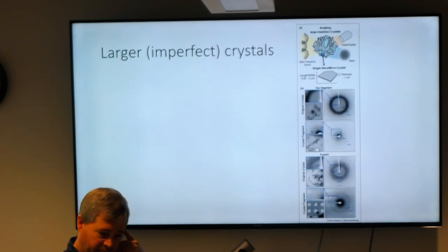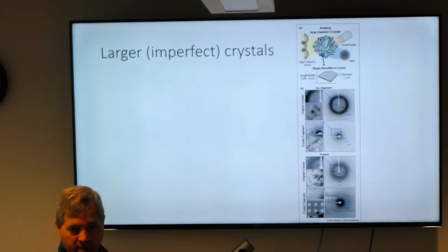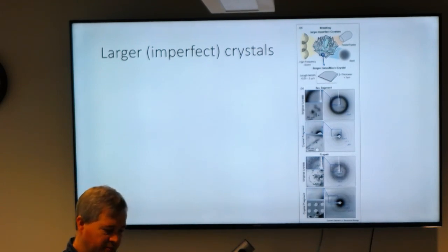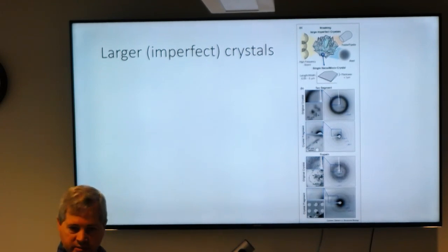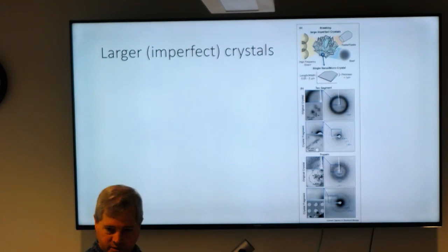And I think if you want this continuous collection, which seems to be what works best, you want a camera with rolling shutter mode, so you can continually collect. So the CETA camera has it, the TVIPS F416 camera has it, but some older cameras or CCD cameras don't have it, so then you're stuck taking still images.